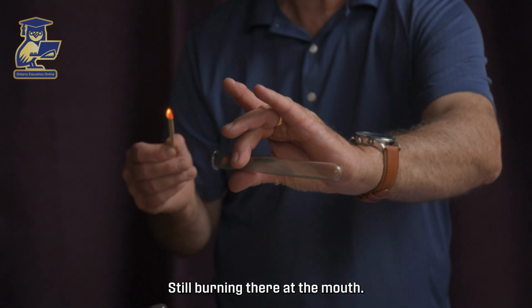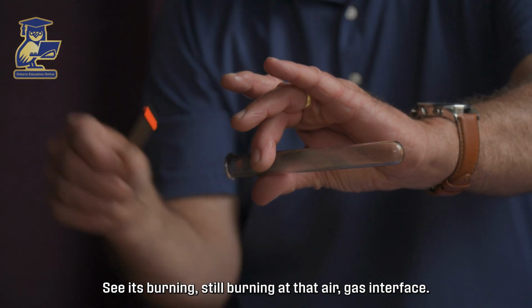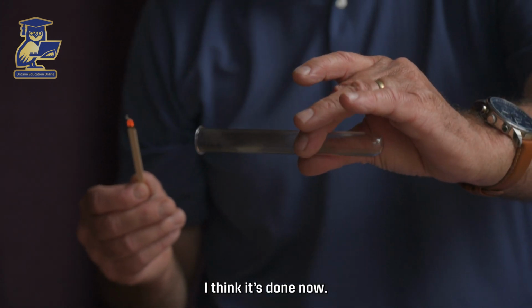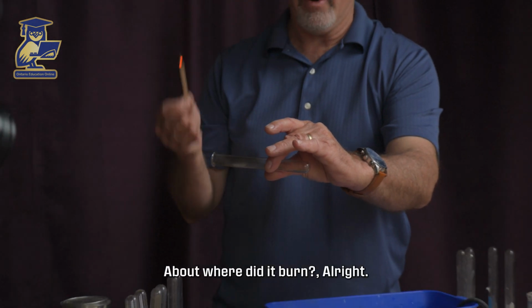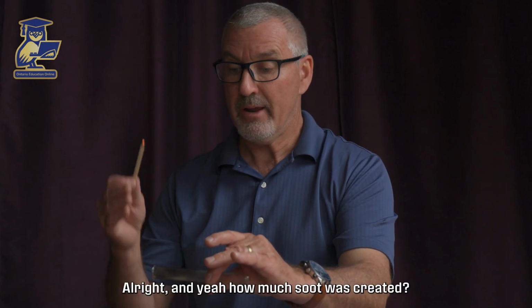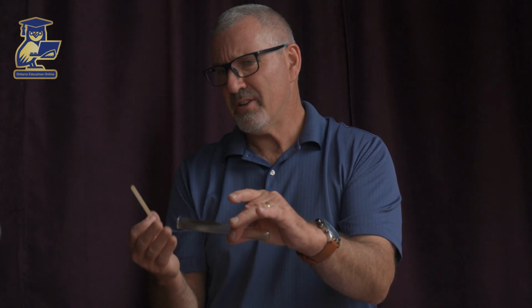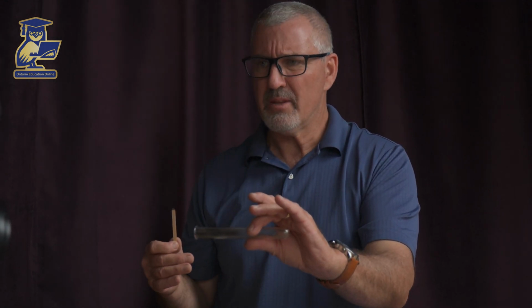Still burning there at the mouth. See, it's still burning at that air-gas interface. It's still burning. I think it's done now. That took quite a while. So make your observations there about where it burned, how long it burned, and how much soot was created. You can see there was a lot less soot for the full one, just because it burned pretty much right at the mouth.